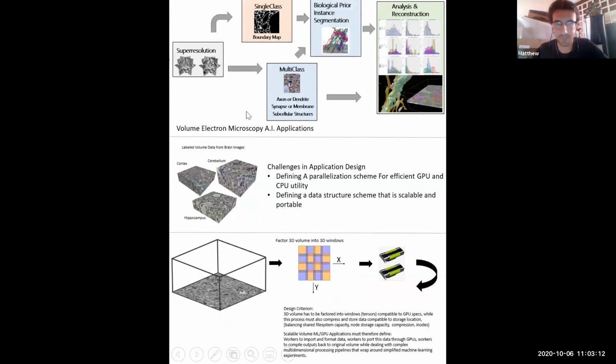problem here. So we developed these workflows that analyze tissues, mostly from brain, in electron microscopy and 3D electron microscopy. That immediately presents one of the biggest challenges in the computational workflows we have to develop, because we deal with multidimensional data as an input. Usually data doesn't become highly dimensional until the intermediate stages in computational workflow design, but we have it as an input, and then we're most interested in developing a sequence or series of AIs, and AIs are also highly dimensional.